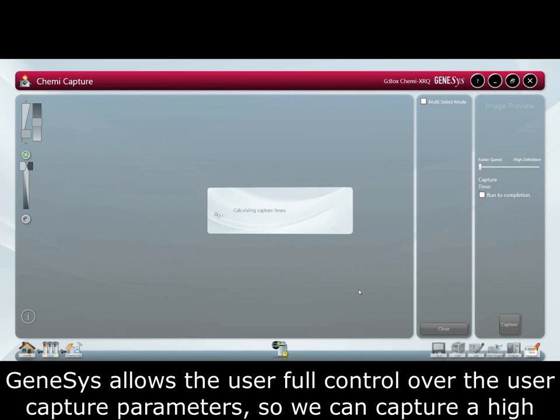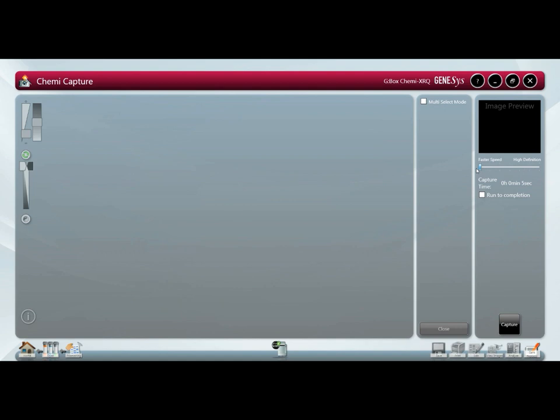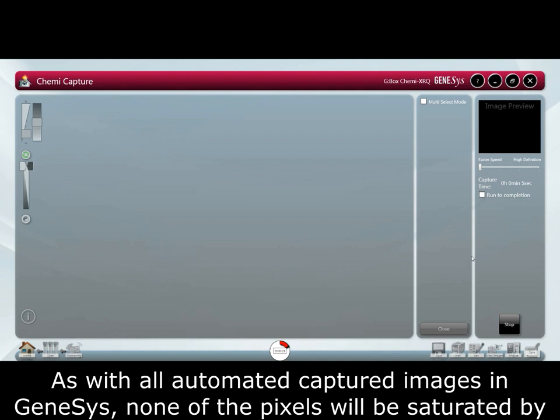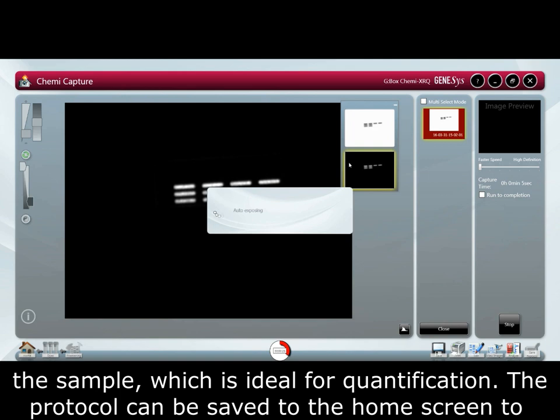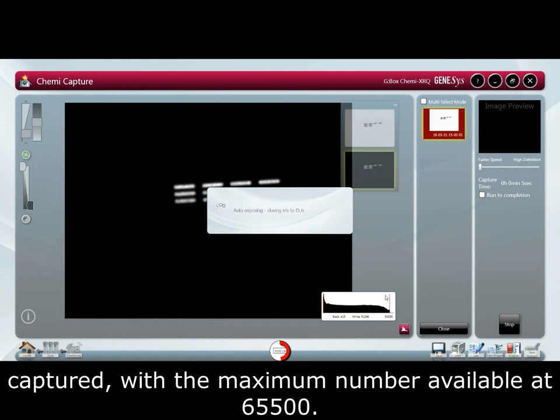Genesys allows the user full control over the image capture parameters, so we can capture a high definition image perfect for publication which uses less binning, or a quick capture to check the presence or absence of bands which utilizes more binning. As with all automated captured images in Genesys, none of the pixels will be saturated by the sample, which is ideal for quantification.